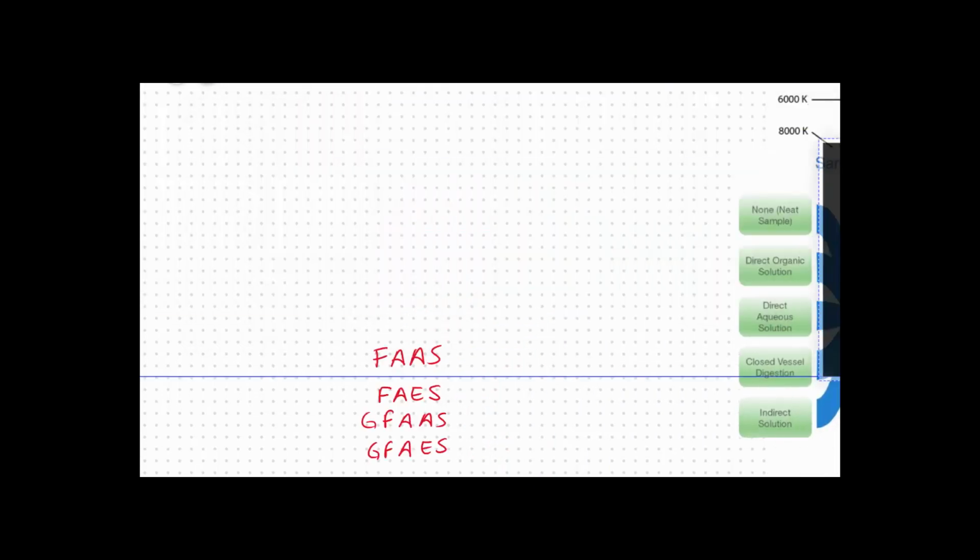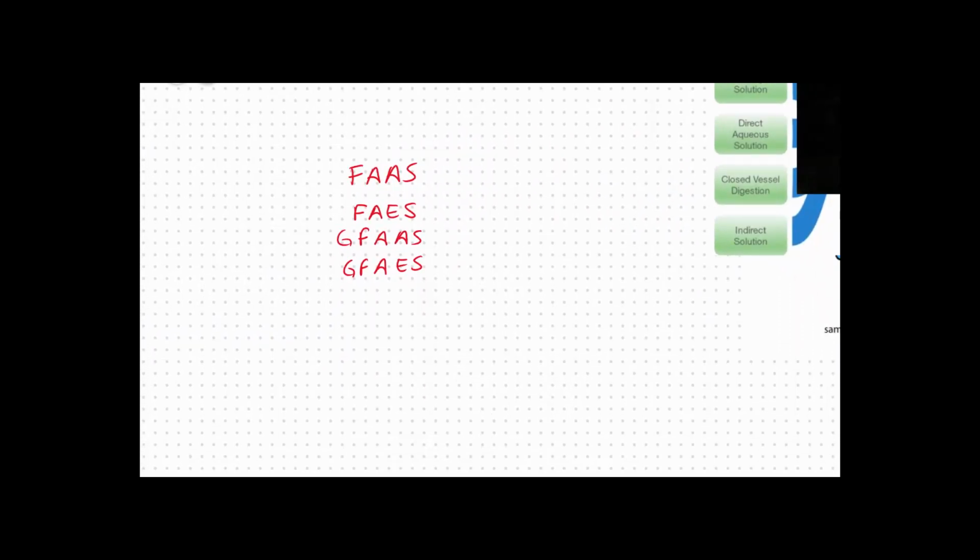So we have these different techniques, and I just said that the ICP-MS is probably going to be the most sensitive. So this has the highest sensitivity. It's also the most expensive. Now, the flame, both absorption and emission, that's going to be the lower cost. So if you're going to do something quick and dirty, you always use a flame first. Furnace, it uses the same machine, but those graphite tubes can get expensive with their consumables.